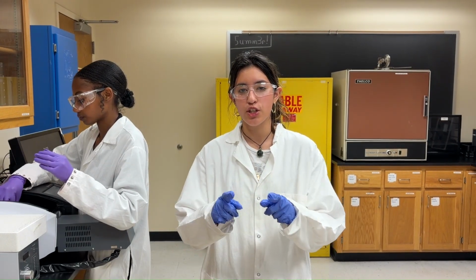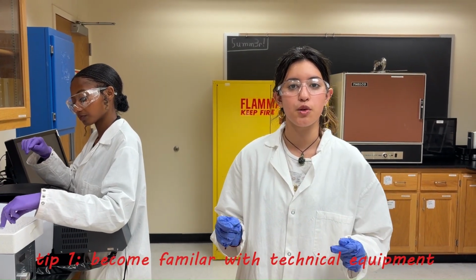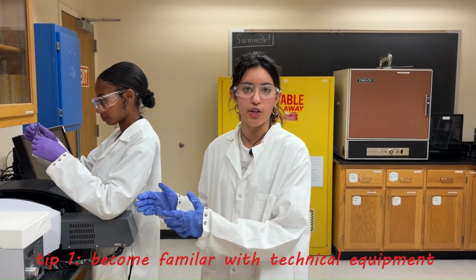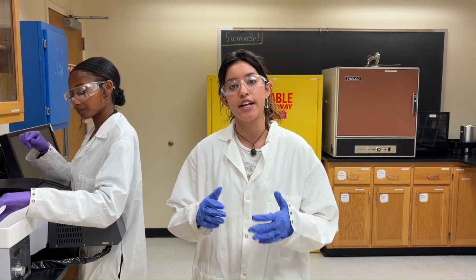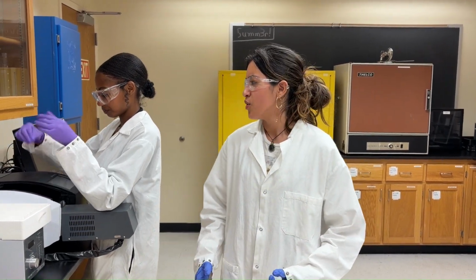Welcome to the dye absorption lab. First things first, you're going to want to make sure that you're familiar with any technical equipment, such as the UV-Vis spectrophotometer. This is going to measure the absorbance and curate our calibration curve.